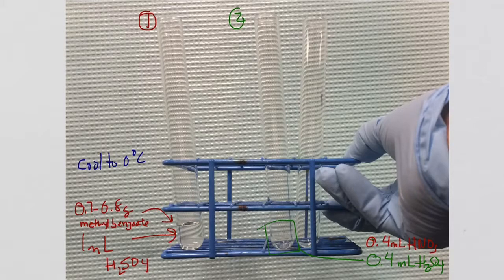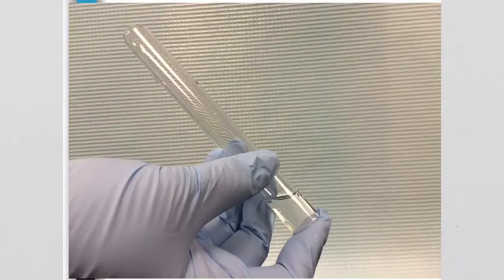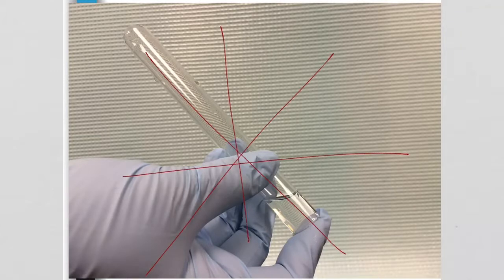Now, in order to mix these, the lab handout talks about how you want to mix them to make sure that the mixtures are homogeneous and not in 2 layers. When you do that, you might be tempted to just put one finger on top of the test tube and invert it like this. And if you do that, you will be very, very unhappy. So do not do this. I will show you how to mix the reagents when we get to lab this week.